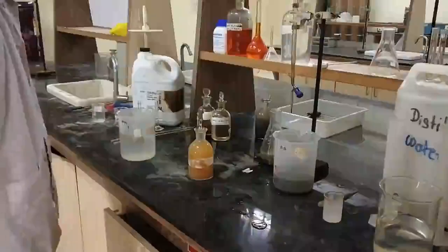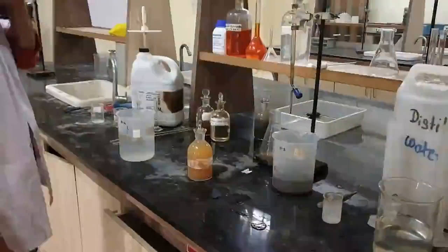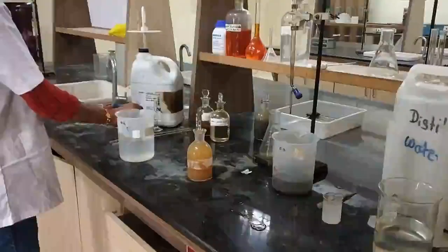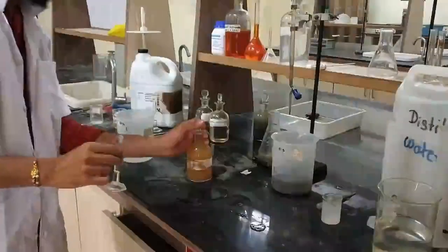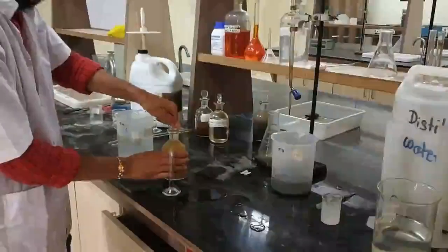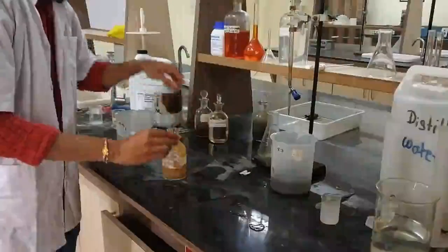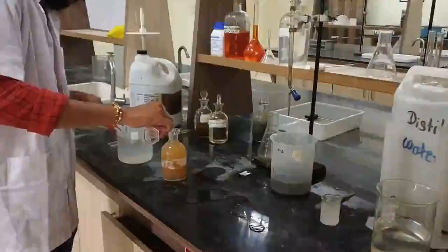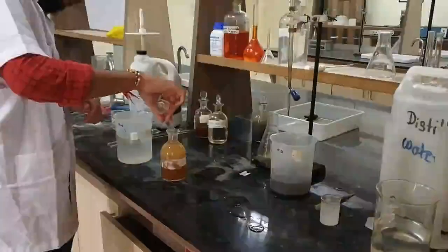So the next procedure is we have to give the acidic condition for the free liberation of iodine. So we are going to add 2 ml of concentrated sulfuric acid in this bottle. Please note down the reaction that is happening. You can see a turbulence that is created in that bottle.